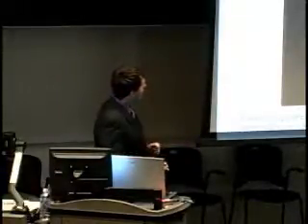And to give you an idea of some of the tools that neuroscientists are currently using to analyze this data, this is a quick demo of Reconstruct. It's a software program that is about 3 years old and is currently used worldwide to do neuron reconstruction. The way this program works is the user is given an interface where he can outline the 2D cellular boundary of the cross-section of a neuron and then move to the next section and repeat this process, section by section. And by doing this, the neuroscientists are telling the computer what pixels should be grouped together in order to form a neuron.